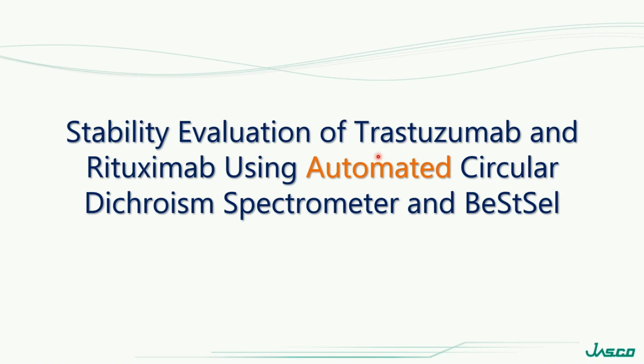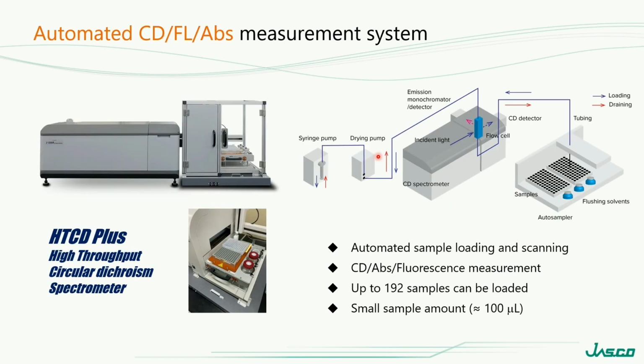Then I will present an application using automated CD spectrometer and SSE. We have developed HTCD Plus, fully automated sample loading, spectrum scanning, and flow line flushing.